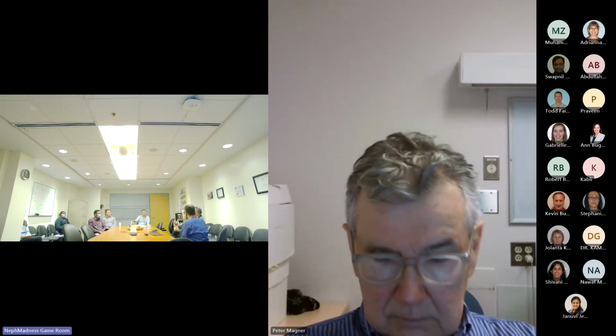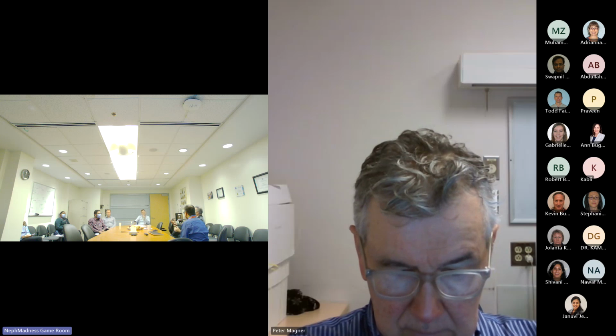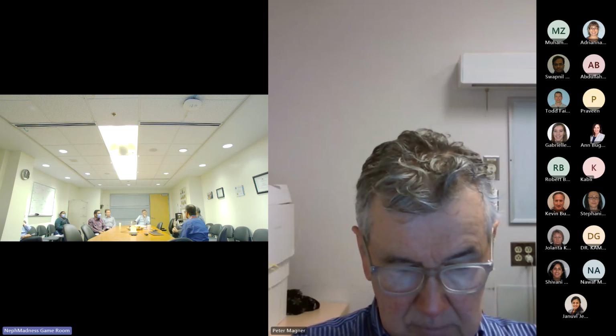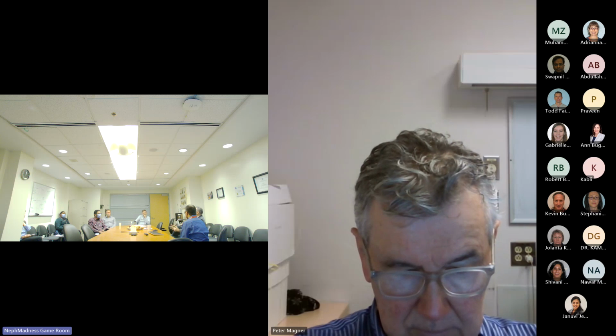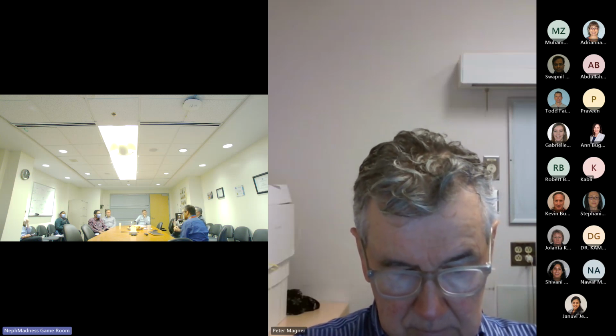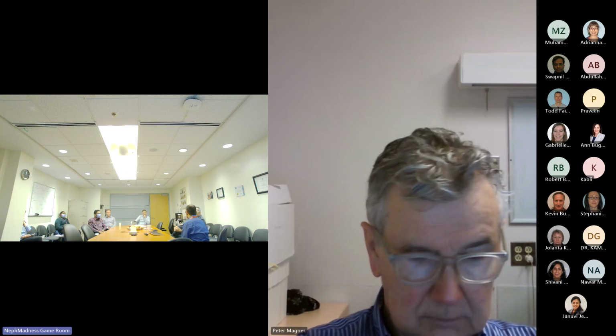A lot of the naysayers who go against microscopy are not fully proficient. If you don't have full ability to extract the information, of course you're going to see it as irrelevant or not very helpful. But it's really informative if you are able to do it properly and get all the information from it. And you have to do it often to get better at it.